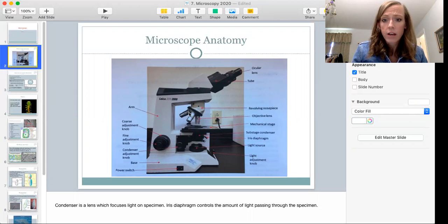On these objectives here, you want to be able to turn to the appropriate objective lens to view whatever it is you place on the stage, which is right here. Remember that whatever it says here is going to be multiplied by 10 because you've got a 10 times magnification right there in the eyepiece. We often start with the lowest magnification, just because then you can see the whole picture, and as you need more detail, you can increase the magnification to the point where you can see everything clearly that you would like to visualize.